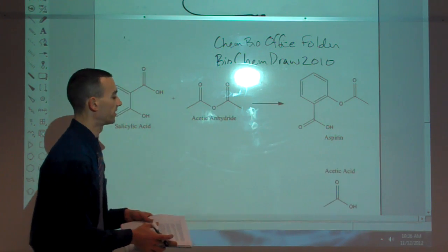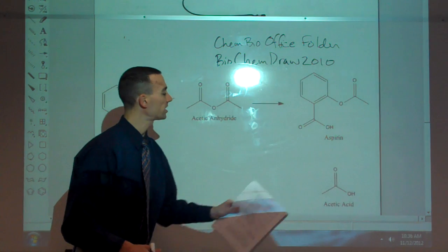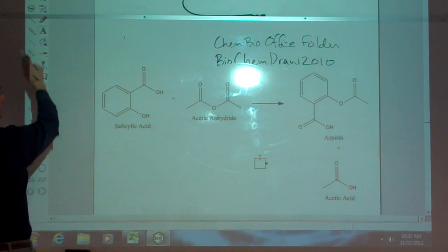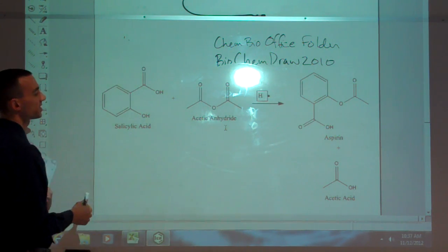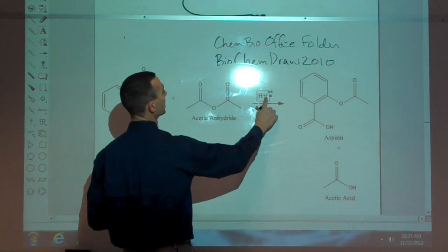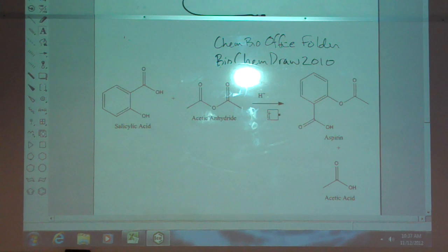Yeah, it's fine if we put it down there. You could resize and space things around. We probably need another plus sign in there. Now there's one other thing in this reaction. We added in strong acid, sulfuric acid. So we would generally use a text box and type in H with a plus sign, and that represents acid. And then if we really want to be great, we would highlight the plus sign and then use our superscript tool. There we go. Okay?